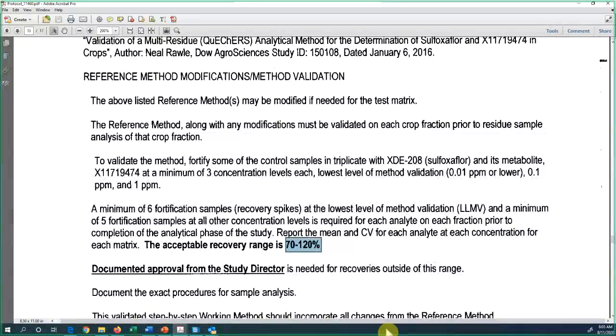When you spike 1 ppm, but for some reason the pipette is not good, you spiked 1.01, which is possible. Then even if you get everything else perfect, you still get 101% recovery. If you add those things together, it's possible to get more than 100%. So if it is between 100 and 120, most likely you do not need to mention it, you just need to report.